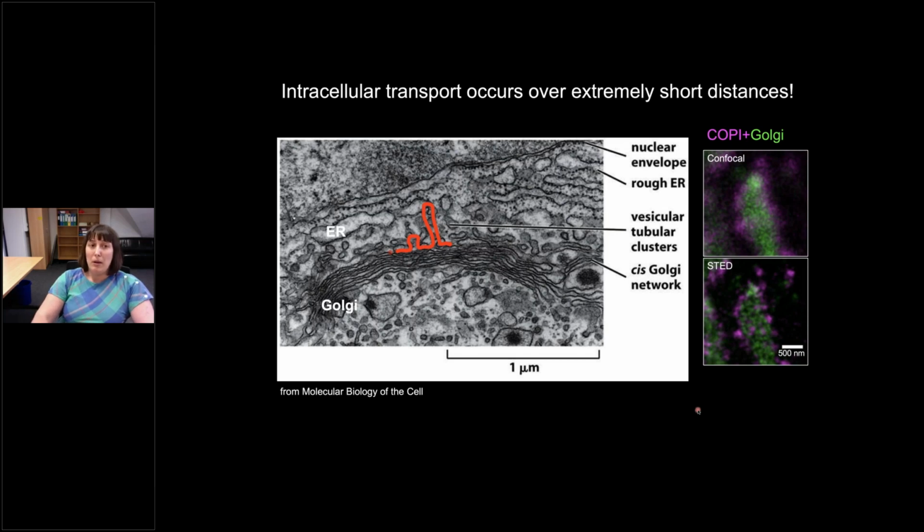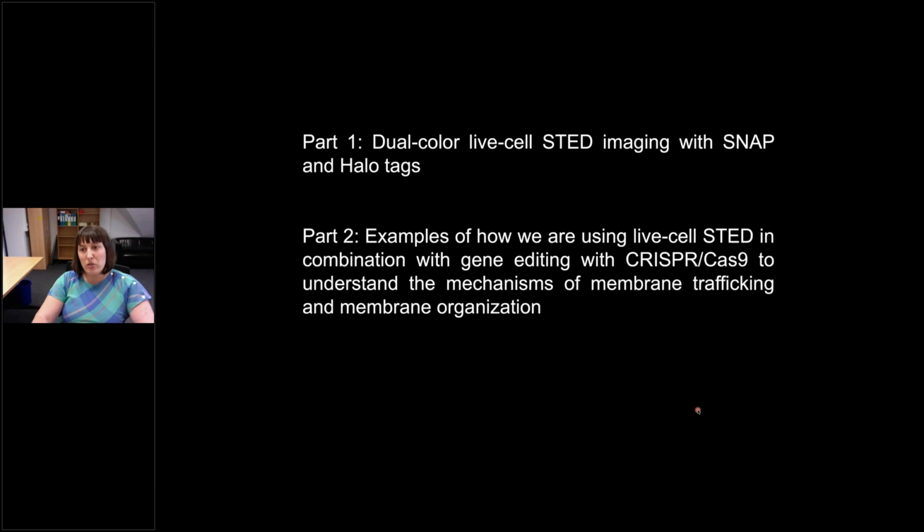I'm pretty sure that for this audience, I don't really need to introduce STED microscopy, so let's dive straight in. I divided my talk in two parts. In the first part, I'm going to talk about how we do dual color live cell STED imaging using SNAP and Halo tags. In the second part, I want to show you some examples of how we're harnessing live cell STED, in particular in combination with gene editing with CRISPR-Cas9 technology, to understand the mechanisms of membrane trafficking and also membrane organization.